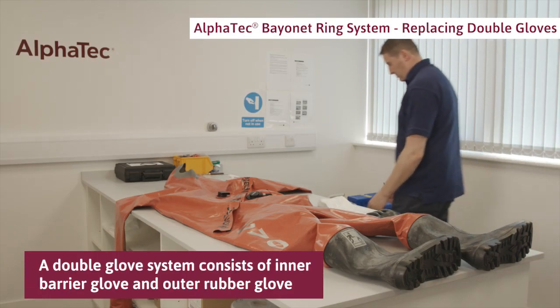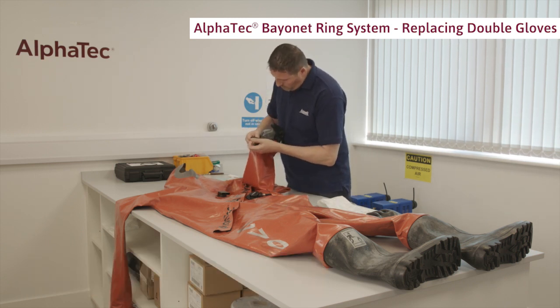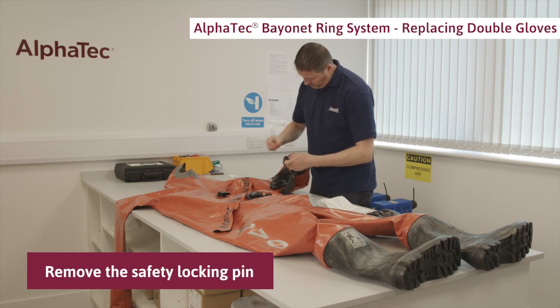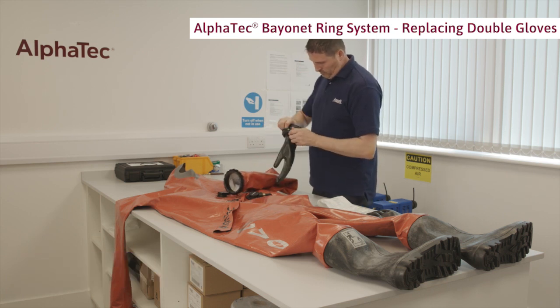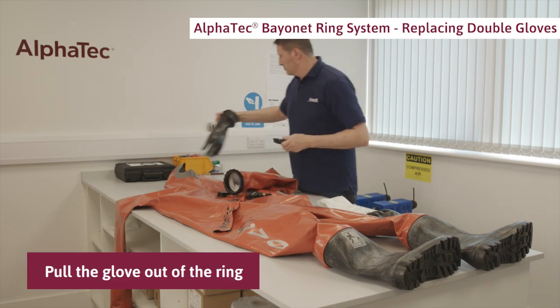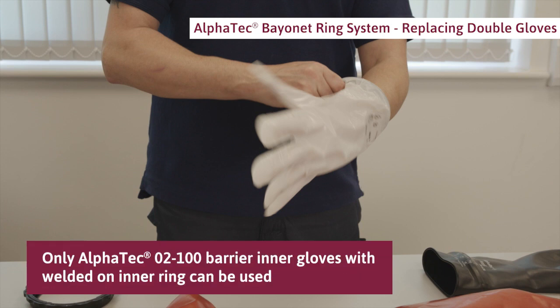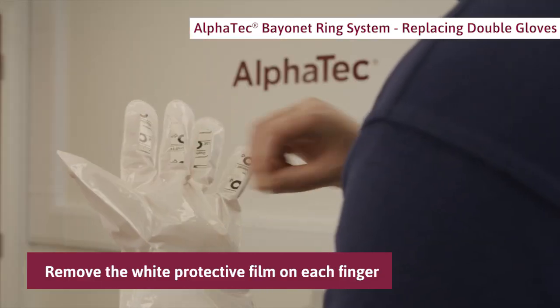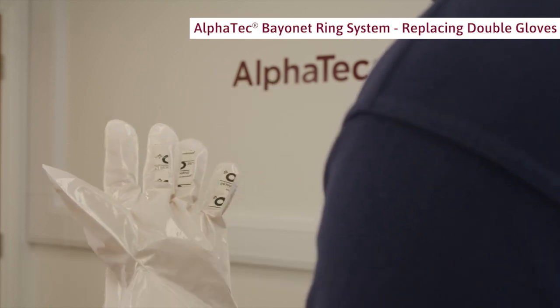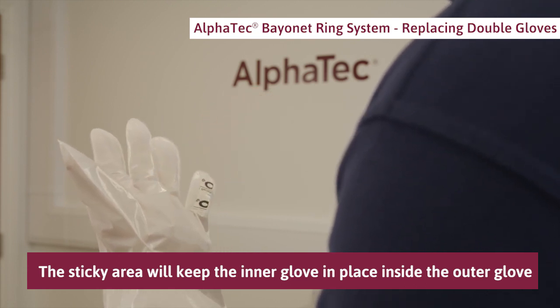Let's take a look at how to replace a double glove system consisting of an inner barrier glove and an outer rubber glove. Remove the safety locking pin, push the rings towards each other and turn to open the ring system. Pull the glove out of the ring. Take a new Alpha Tech 0 to 100 barrier inner glove — only Alpha Tech 0 to 100 barrier inner gloves with a welded-on inner ring can be used. Remove the white protective film on each finger of the inner glove; this will uncover a sticky area that holds the inner glove in place inside the outer glove when the hand is retracted.